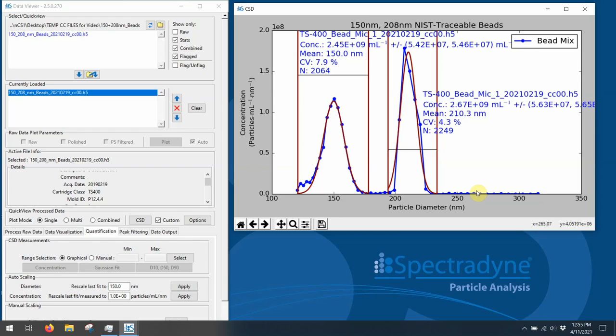It's important to remember that in this calibration run, I used the default calibration values for size and concentration that are supplied with the instrument software. Absolutely no adjustments need to be made. This is one of the key benefits of the NCS1's microfluidic cartridge implementation. In the majority of use cases, there are no adjustments necessary to keep the instrument running in specification.